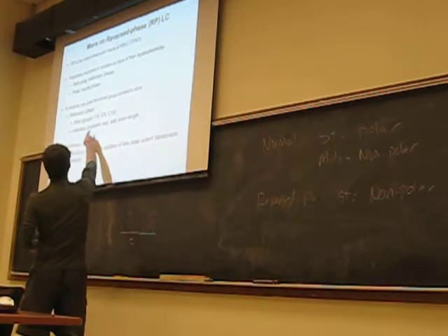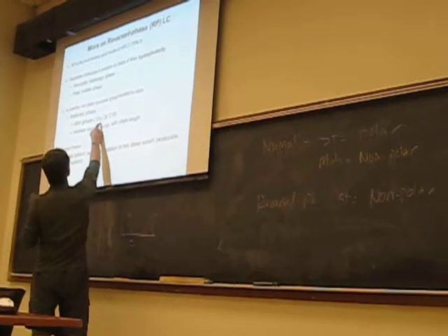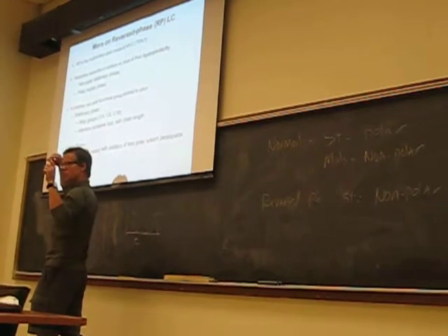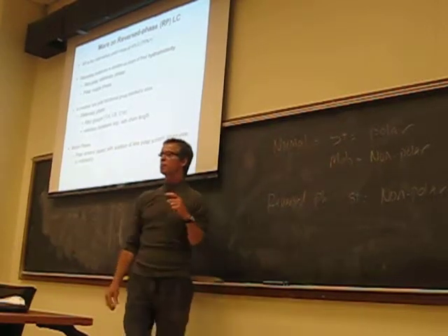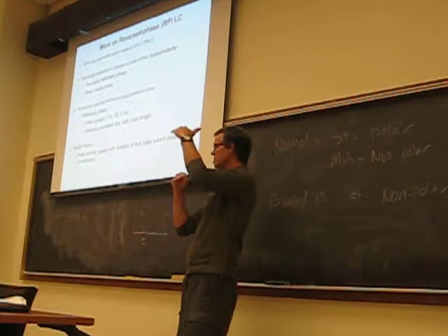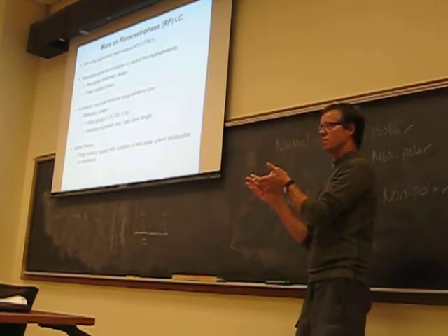So one thing that I want to point out is that the stationary phase typically varies. If you buy the column, it would either be a C4 column where it's only a 4-carbon chain, 8-carbon chain, or an 18-carbon chain. And the C18s are probably among the most commonly used. And so that's a very long carbon chain in that stationary phase that provides very strong hydrophobic character to that stationary phase.